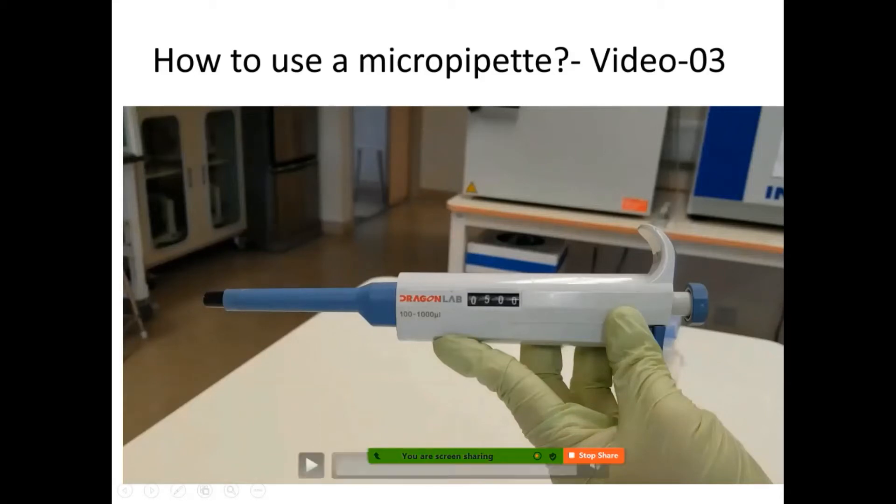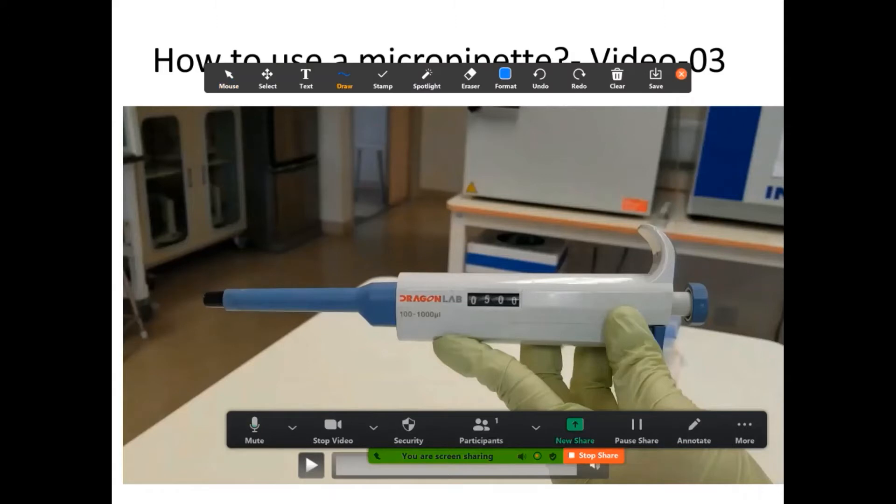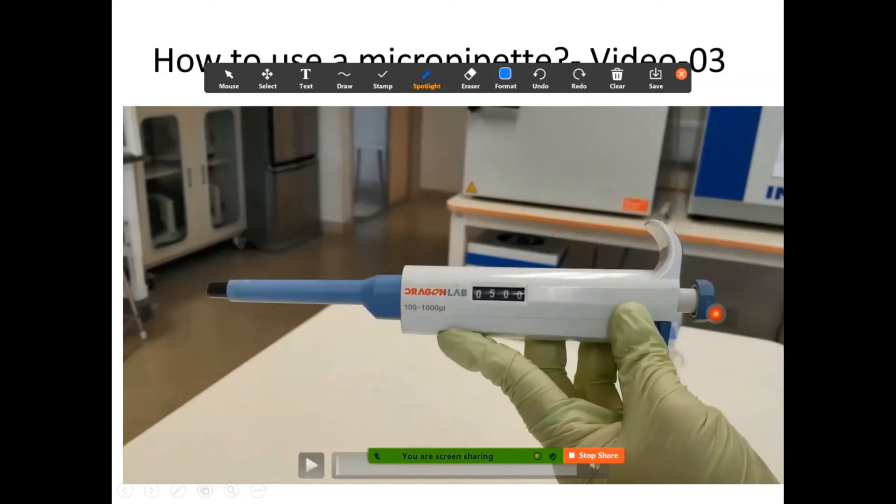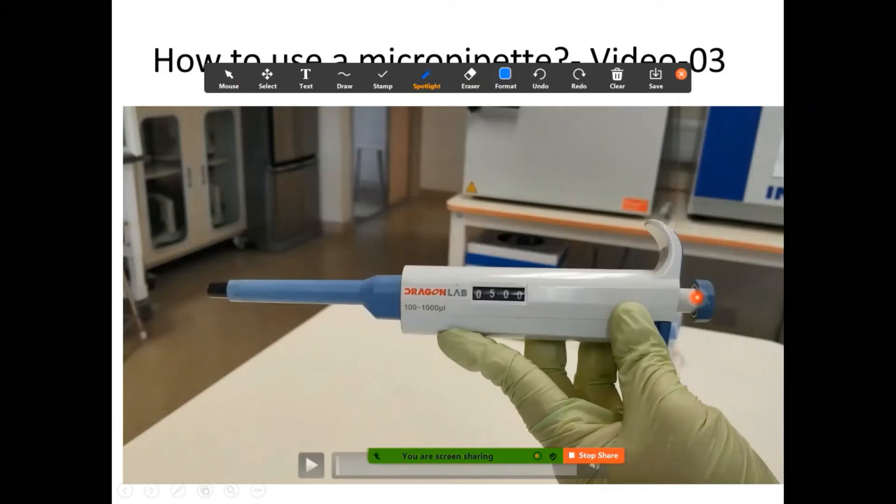Next is how to use a micropipette. The top part is the plunger — this is where you can control the volume by turning the knob at the end and also by pressing it to extract fluid. There are two stops: when you extract fluid, press to the first stop, insert the micropipette tip into the solution, then slowly release the plunger. The second stop is used to remove the excess fluid from the tip of the micropipette — that clears the remaining fluid from the tip.